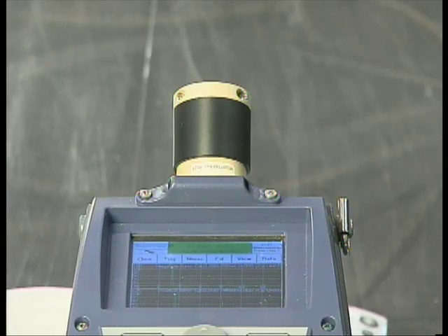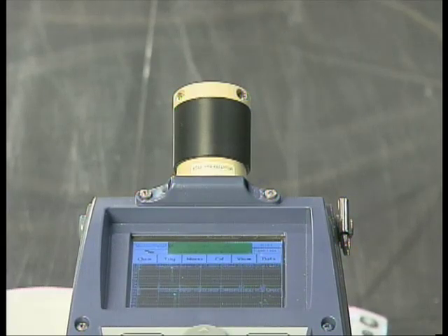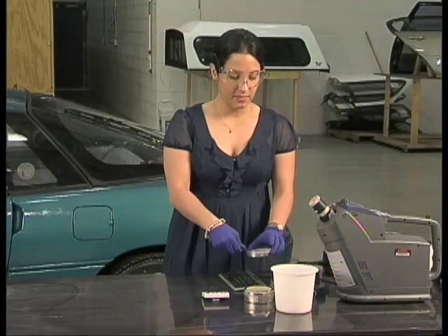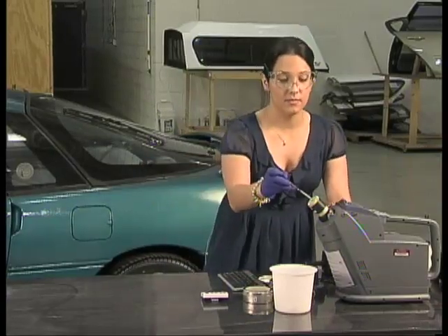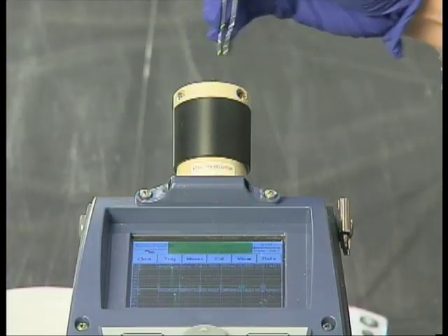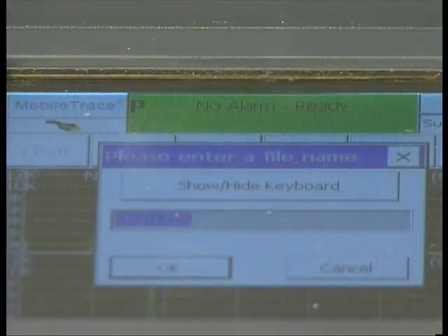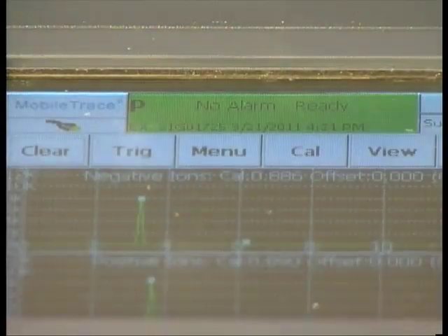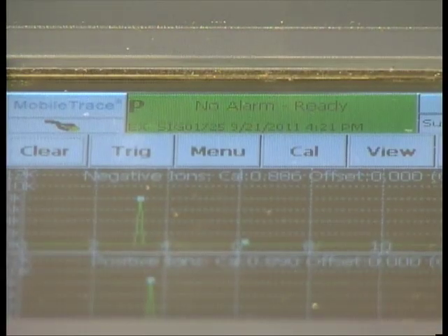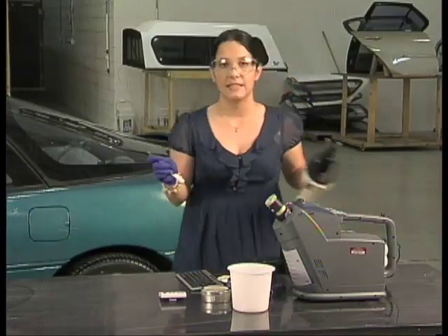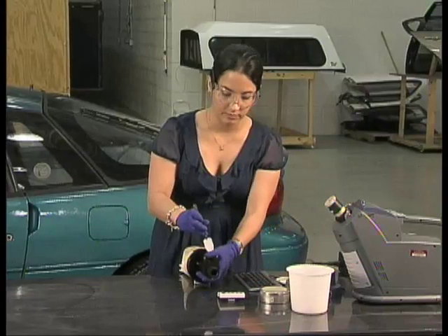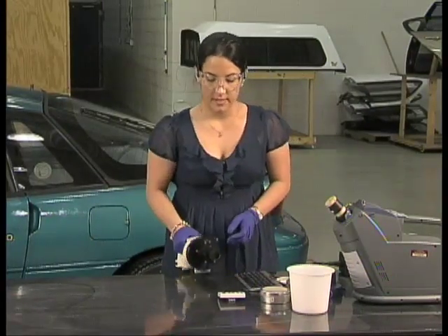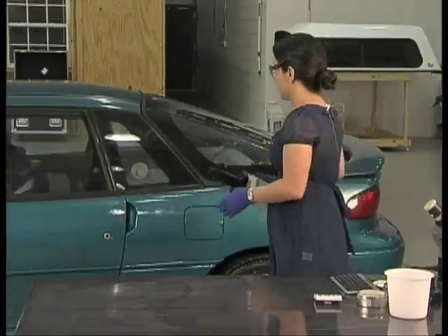Now we will perform a dynamic PSPME extraction on a hide placed in this car. The hide is an electrical box containing a heat-sealed bag with 50 grams of smokeless powder, and it has been in the car. We will take the PSPME device and introduce it into the instrument to obtain a blank sample. The no alarm ready sign indicates that the PSPME is blank. We will remove it from the desorber and place it into our air sampler.